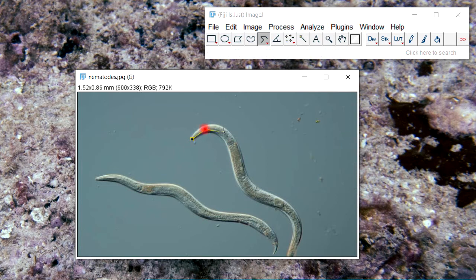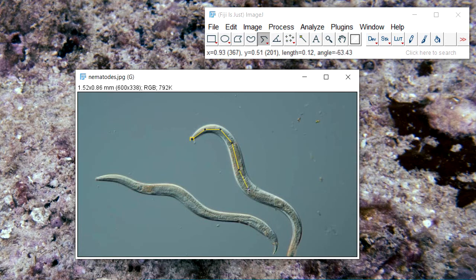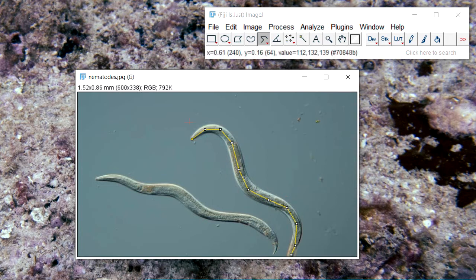Every time you left-click, it will go to the next part of the line. Keep doing this until you have the outline, and for the last point you right-click. This will stop the entire selection.